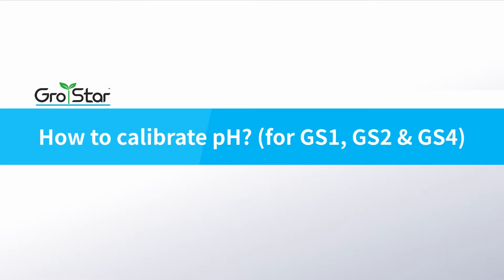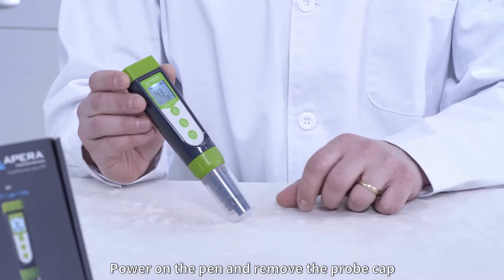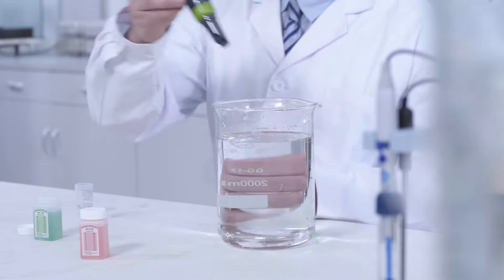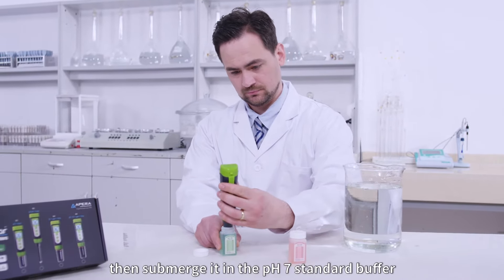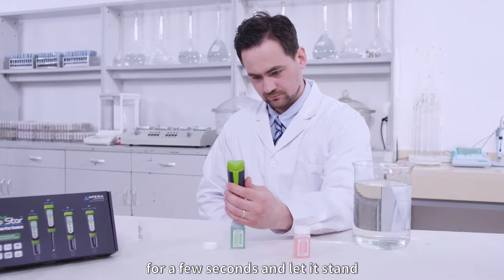How to calibrate pH. Power on the pen and remove the probe cap. Always calibrate pH 7 first. Rinse the probe with clean water and shake off excess water, then submerge it in the pH 7 standard buffer.